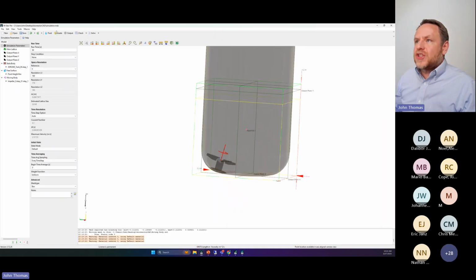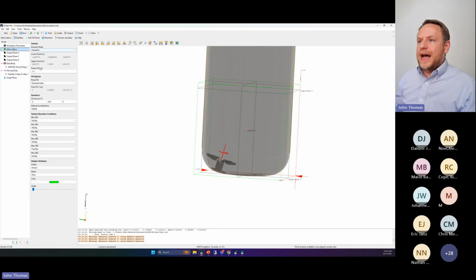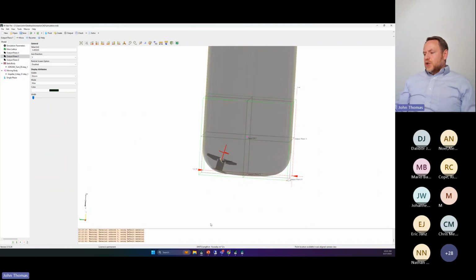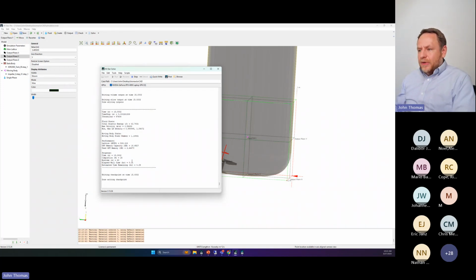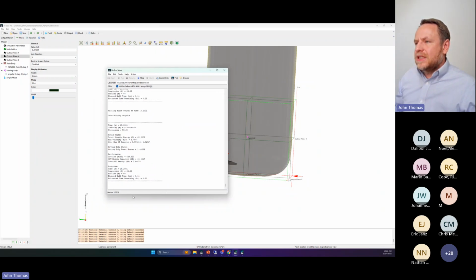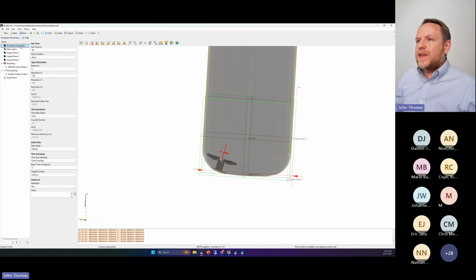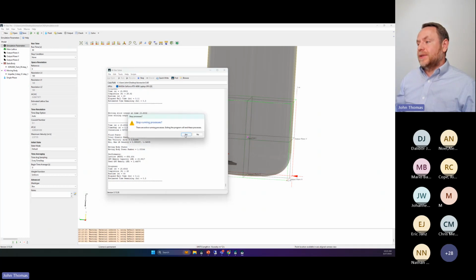So I'm going to go back and change this to a single phase simulation, and I'll drop this fluid height back down to where my fluid volume should be. Let me reset this point here. If I go ahead and run this and look at this, I was previously running at about 650 million lattice updates per second. And it would have taken about another 20 minutes to simulate the remaining 45 seconds of my process. I'm not doing that right now. I'm going to stop this, but you see, as I walk back that VOF, this is going to run much faster.